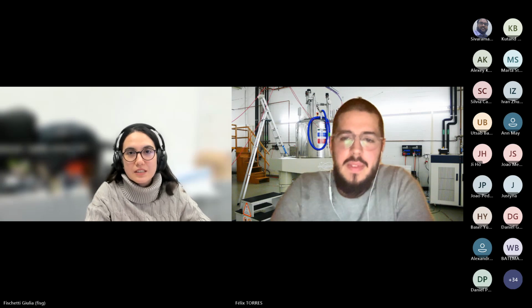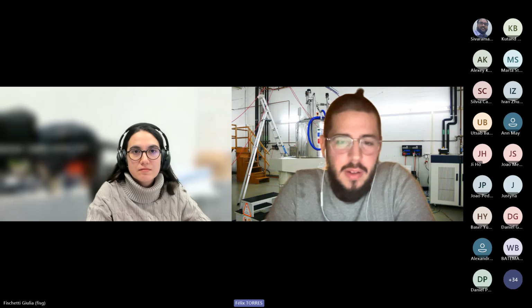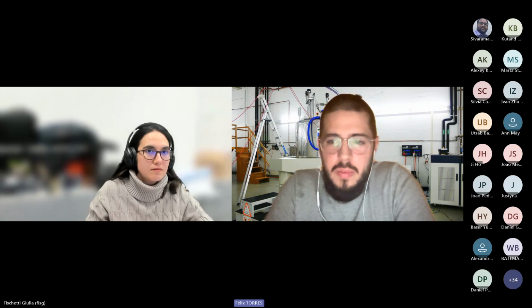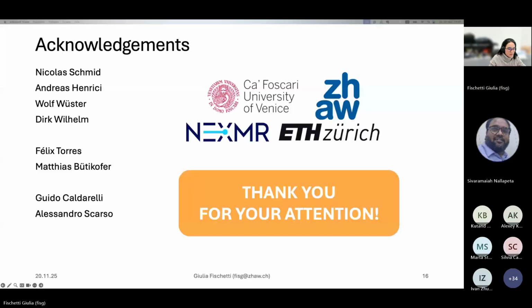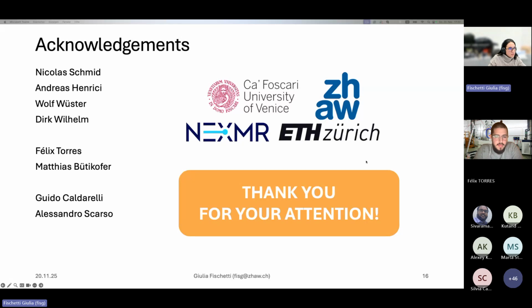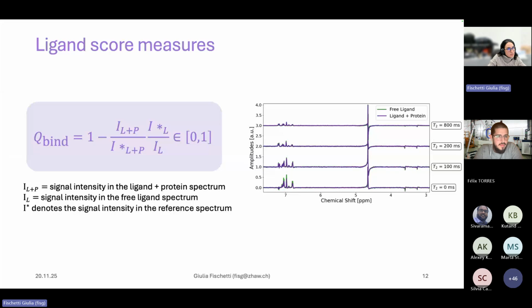Thank you. We have a second question from Alexei Kiryutin, who is asking on slide 12, what does T2 mean? I think he's confused whether it was the delay or the relaxation time. It was the relaxation time. Yes, and I confirm, because this is our first program, that this is indeed for how long it relaxes, and not the delay in the first program.